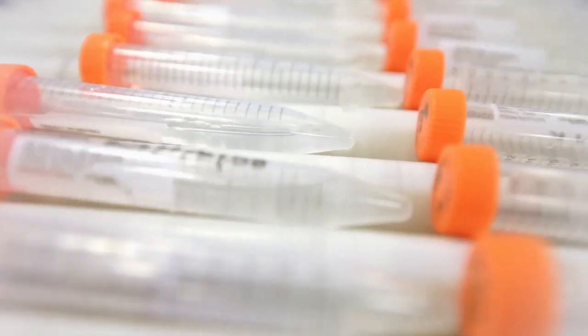Counting cells allows the accurate determination of cell numbers and therefore consistency between experiments. This video will outline the procedure for counting both suspension and adherence cells using a haemocytometer.